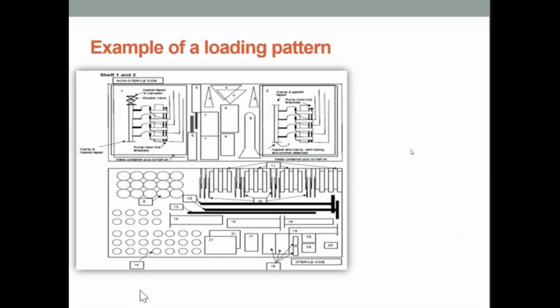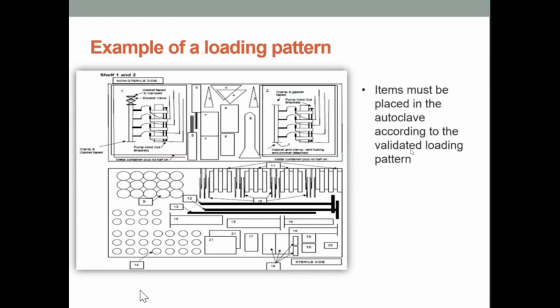This is an example of what a loading pattern looks like. So a loading pattern is how you fill your autoclave. The items must be placed in the autoclave according to the validated loading pattern. Any changes to that loading pattern would require revalidation.